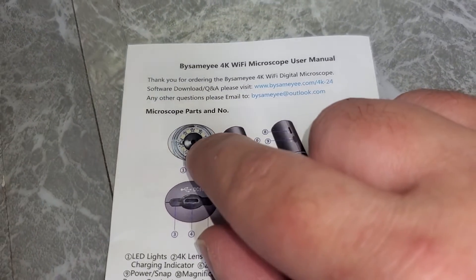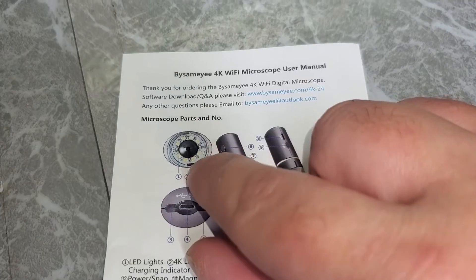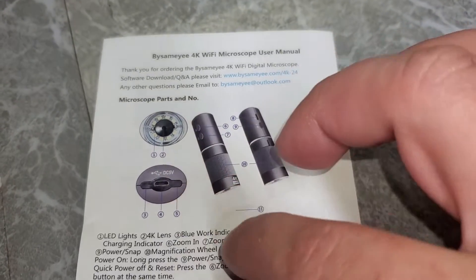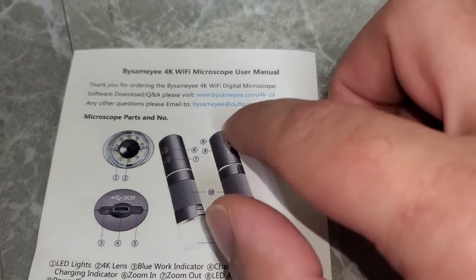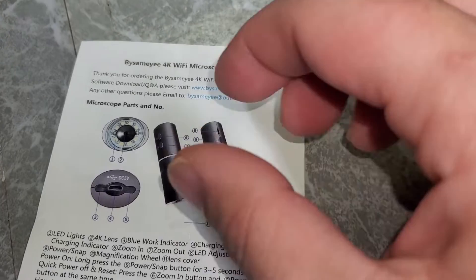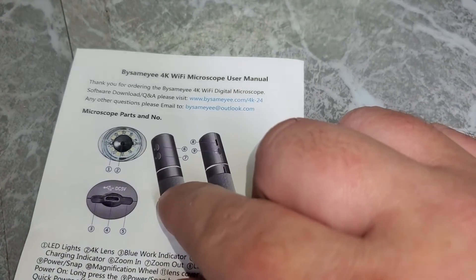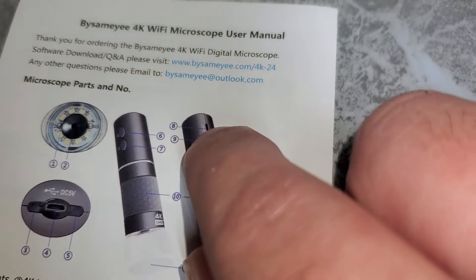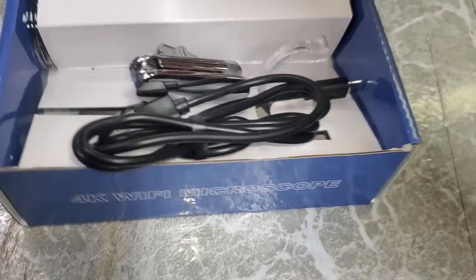Around the lens is a ring of LEDs, which is very common with these types of microscopes. There are zoom in and zoom out buttons, and in the middle is the focal ring — you turn that to focus on whatever you're trying to look at. There's also a brightness adjustment for the LEDs on the front.